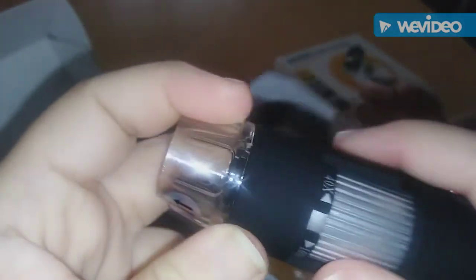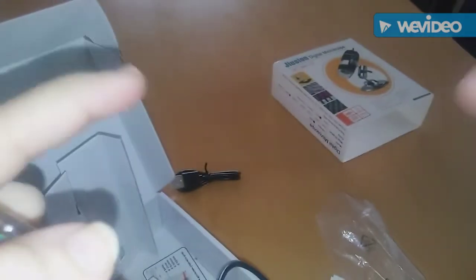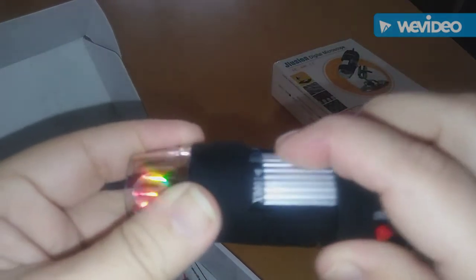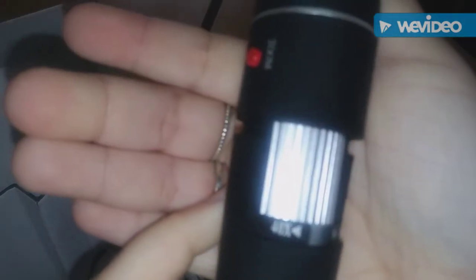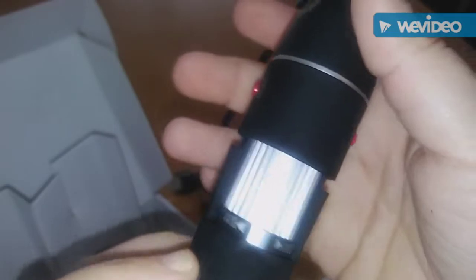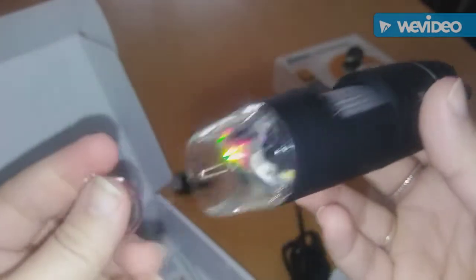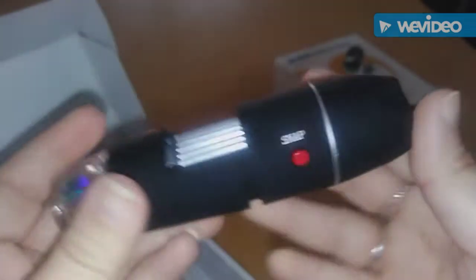I can't show you it working because I'm using my phone to film this, but I'll show you the pictures. I'll include the pictures that I took when I was using this yesterday. This is where you focus — it goes from 40 times zoom up to 1,000 times zoom. You can snap pictures while you're zoomed in. I always put the cap back on after you're done — you don't want any dust or anything getting in there.